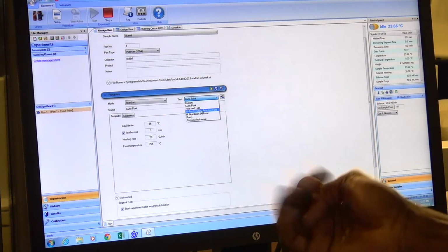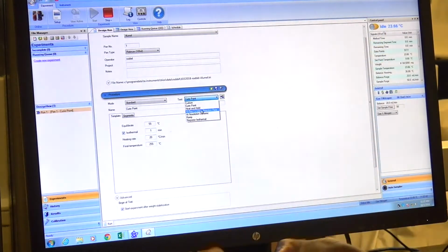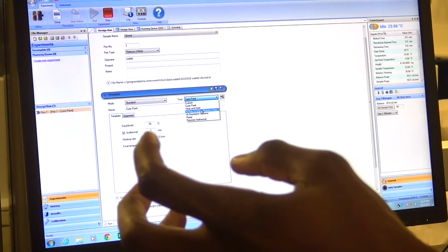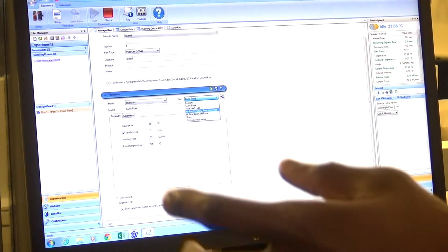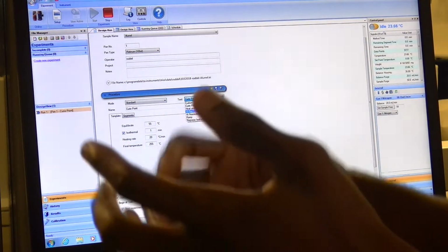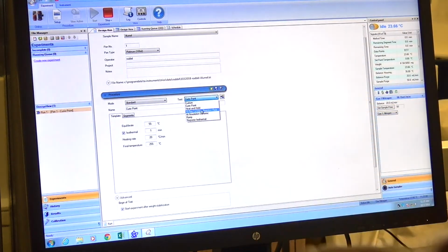So in this case, you can basically set a heating rate of 20 C per minute, and with some other parameters, once it starts detecting that mass change, it can slow down to almost zero, and almost hold isothermal, let that process come to completion, and then speed back up to 20 C per minute again to complete the rest of the experiment.